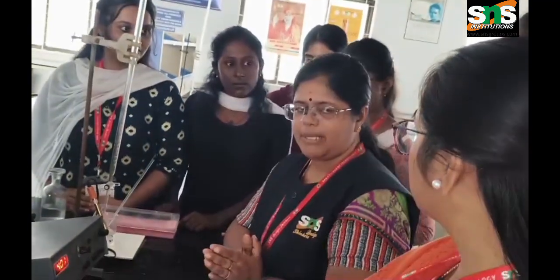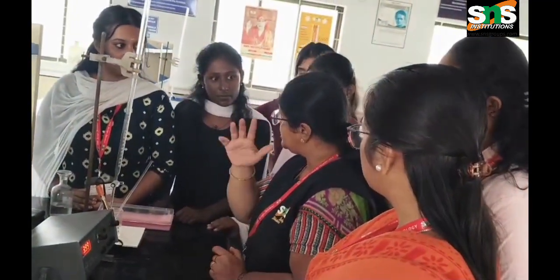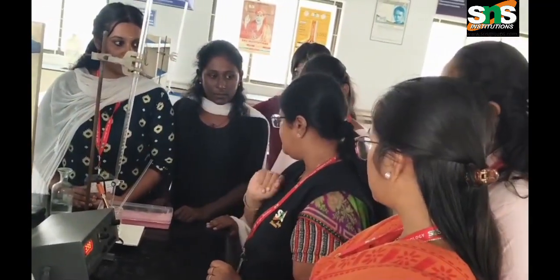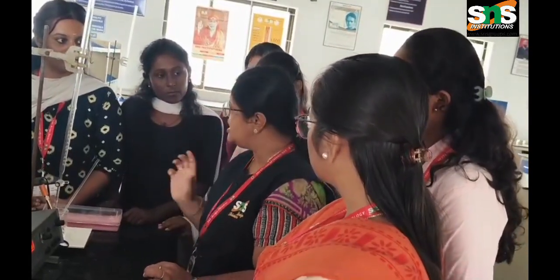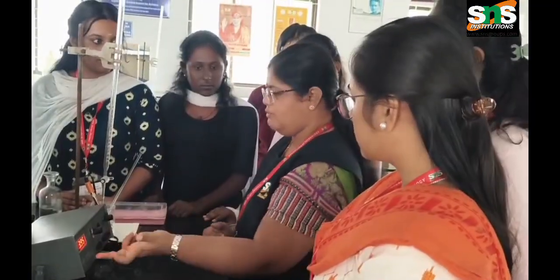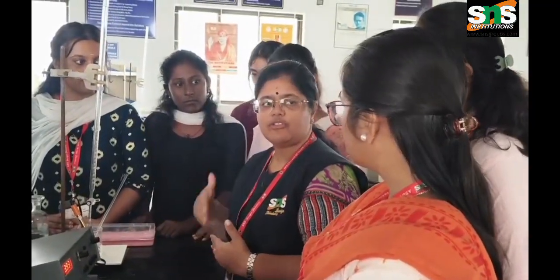First, what will happen? The base reacts with the acid. First the neutralization of HCl is done, because it is a strong acid. Then after that end point, there will be a slight increase in the conductance value of the solution due to the formation of sodium acetate ions.